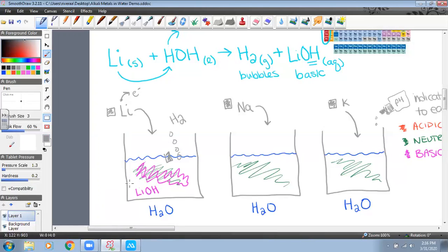On a scale of like 1 to 10, 10 being like that reaction was freaking awesome, to 1 being that was super boring, I don't know, what will we give it? Like a 3? It was kind of exciting. We saw a gas get produced. We saw a color change. Let's rank it like a 3. And by rank, I mean like speed. How fast was that reaction? How exciting was that reaction? We'll say it was like a 3.